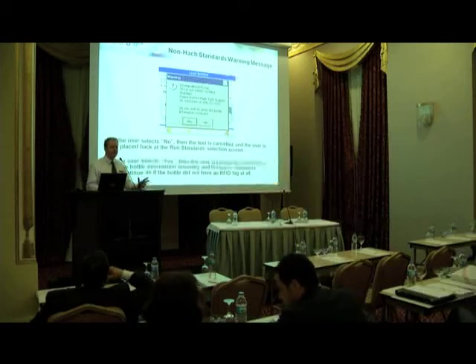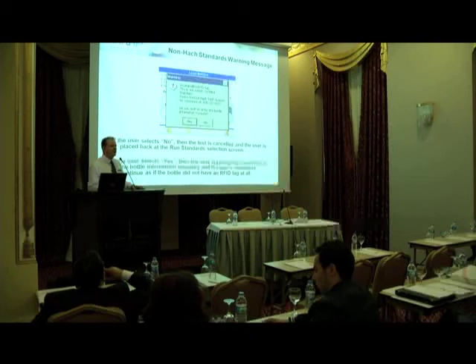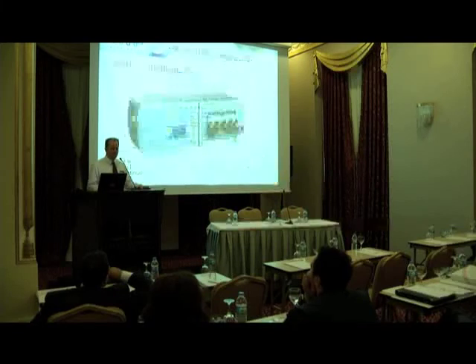If somebody accidentally puts the standards in the wrong place or uses the wrong type of standards, the analyzer will read the RFID tag and it'll say, stop, you're using the wrong type of standards. So this, again, reinforces your confidence that the analyzer has been calibrated correctly.